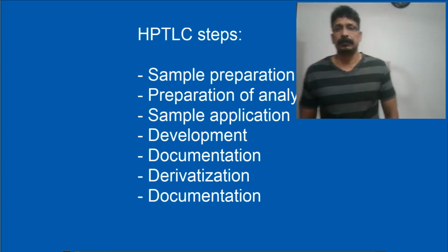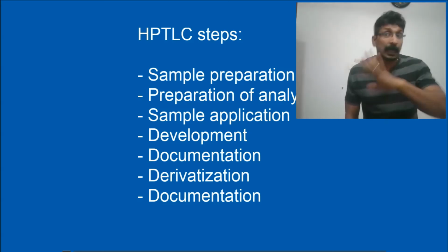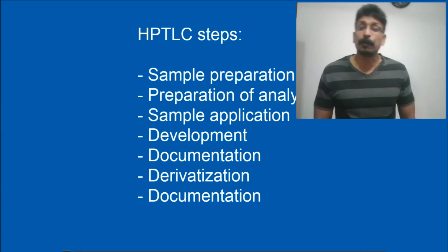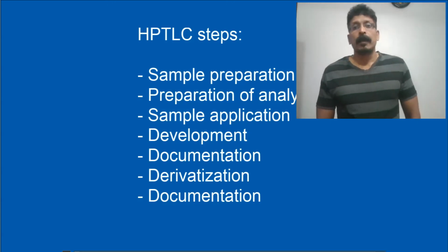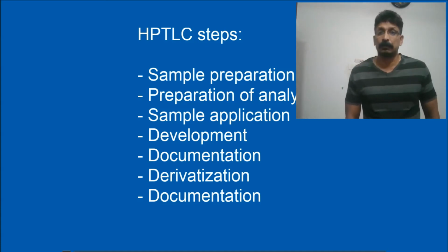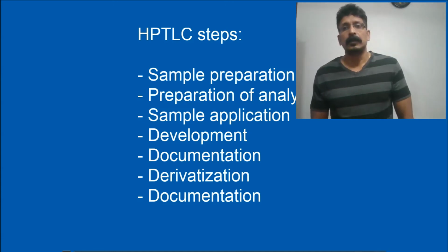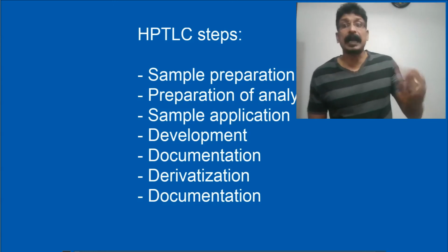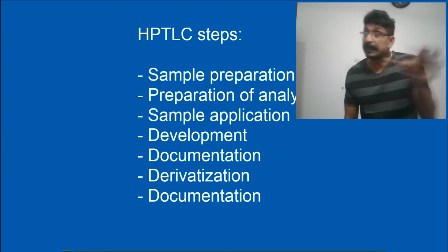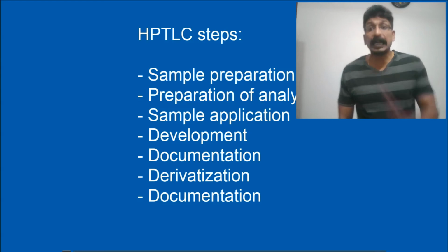And development. You will develop in the thin layer plate. It is high performance, not like the thin layer plate which we prepared. It is automatically very thin, standard and uniform. After sample application, it will be developed by the solvent, the mobile solvent, and then it is documented. Understand? By means of the chamber you can identify visually. Spots can be easily connected with a computer, and data can be easily taken as a printout.